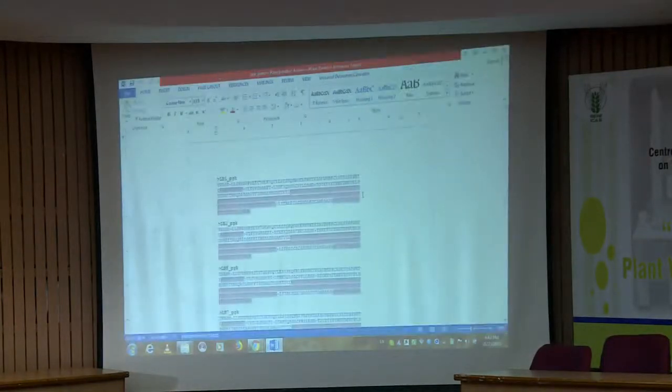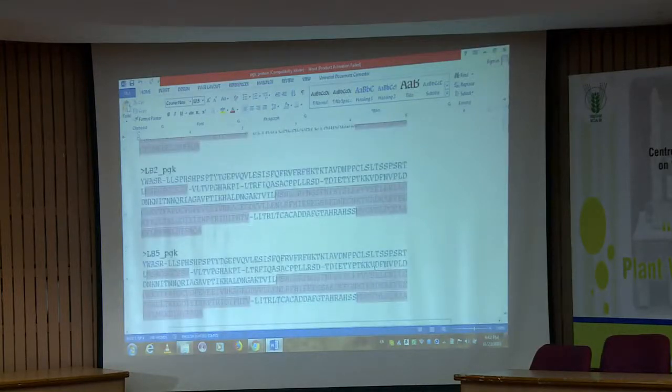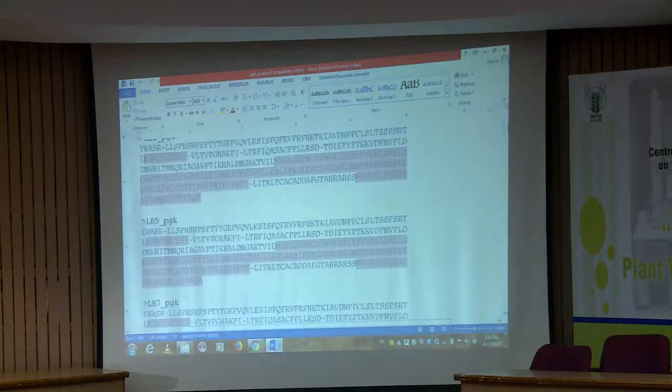So, this is one file I have prepared, you can just have a look, correct. So, it means in this whole sequence from here to here, this region is coding, from this to this again some intronic region is there, from this region to this region again the coding sequence is there, from here to here again the coding sequence is there. So, what will happen when you will be putting this thing in the preparation of flat files, you have to mention the coordinates of the coding region.